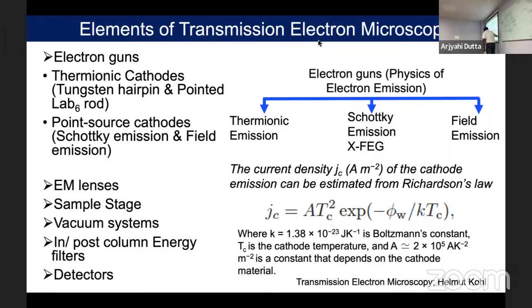If we are using tungsten, it will vary based on the tungsten and the temperature of the metal. And here one more factor is very important, that is the work function. What is that work function? I want an electron from a metal. I want to eject that electron. How do I do it? I have a metal, I have to give some extra energy. Whatever electron is in the periphery region can come out.